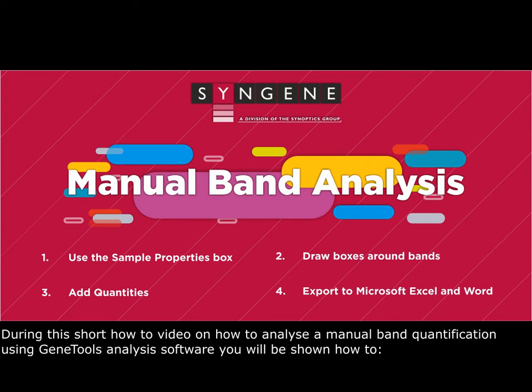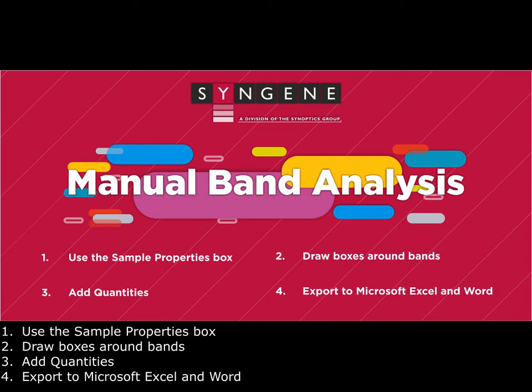During this short how-to video on analyzing manual band quantification using GeneTools analysis software, you will be shown how to: 1. Use the sample properties box, 2. Draw boxes around bands, 3. Add quantities, 4. Export to Microsoft Excel and Word.